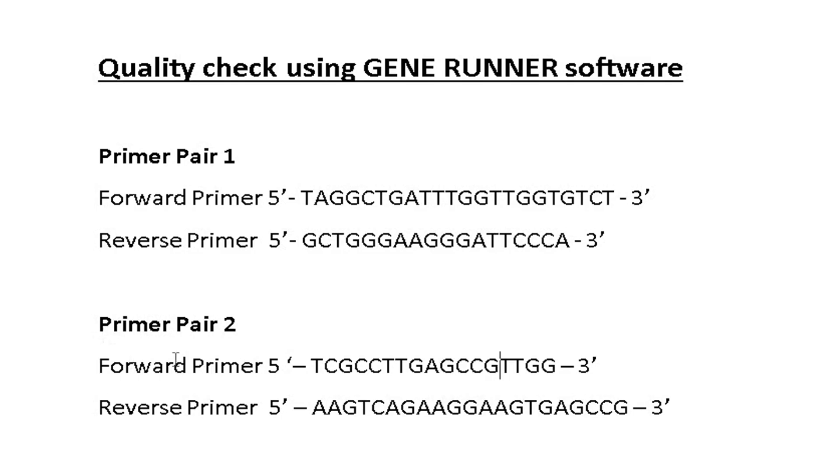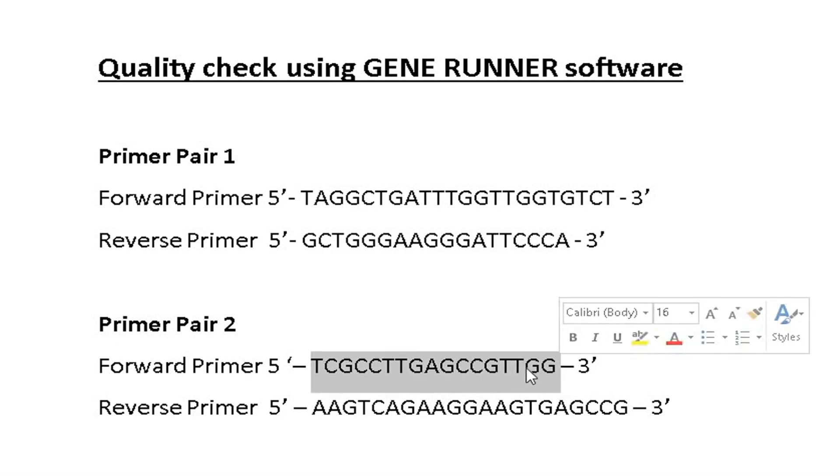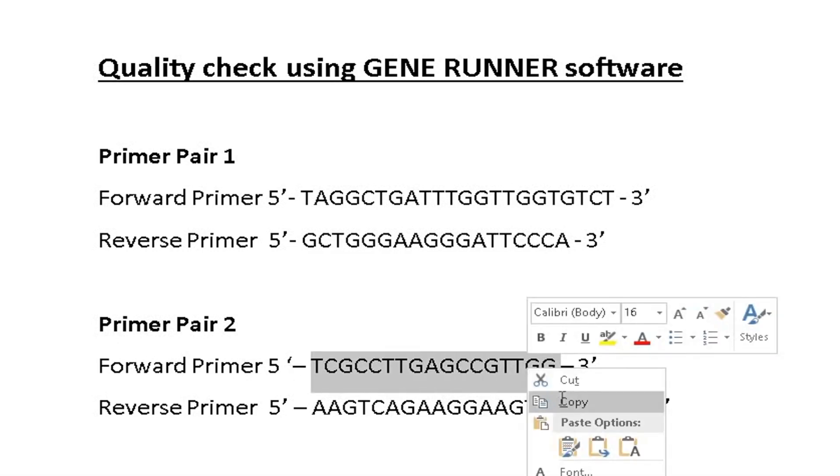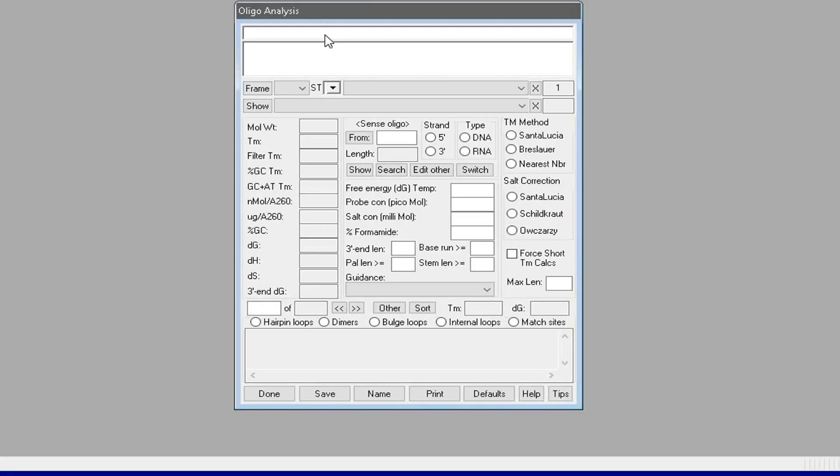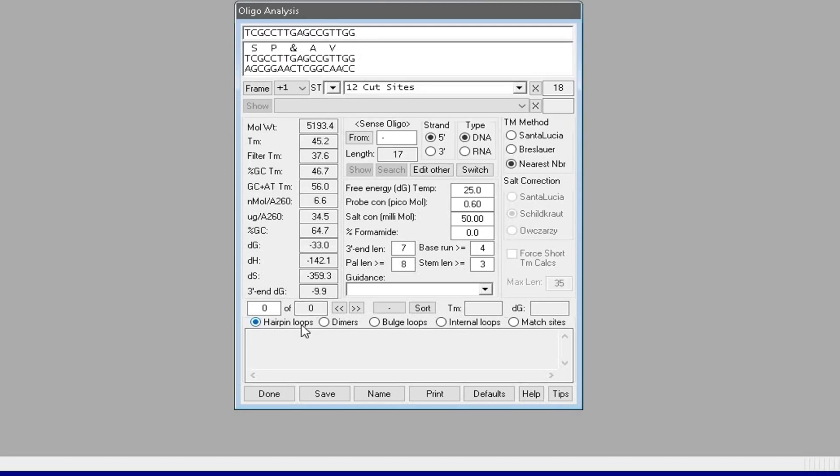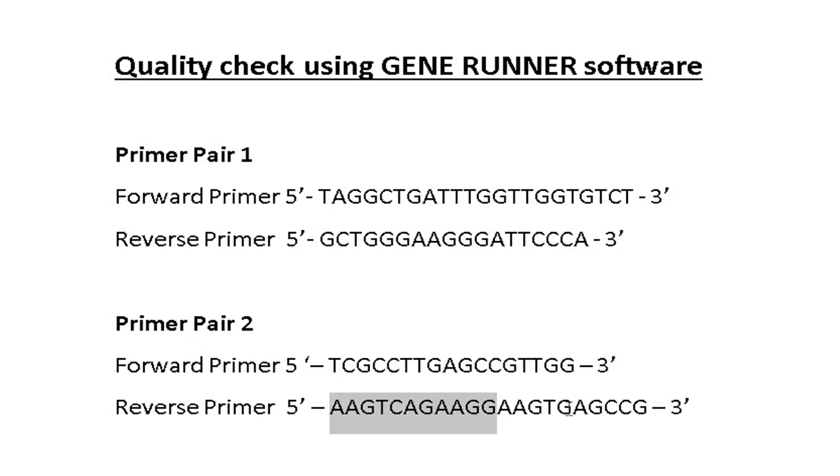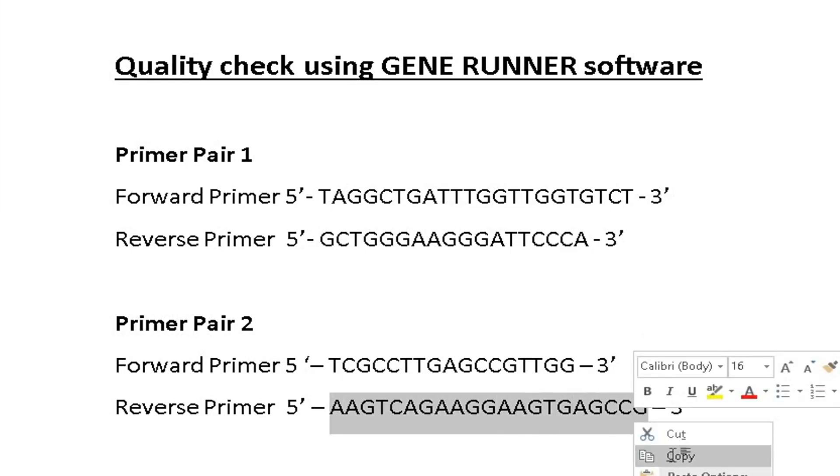To check primer pair two, copy the forward primer sequence and paste it in the GeneRunner software. The software fails to detect any hairpin loops, dimers, bulge loops, internal loops, or match sites.